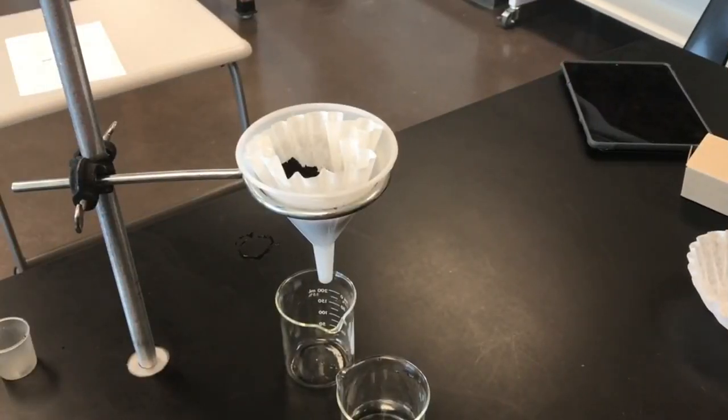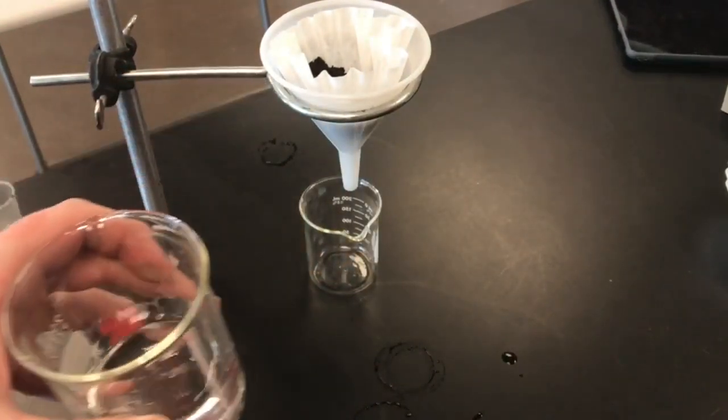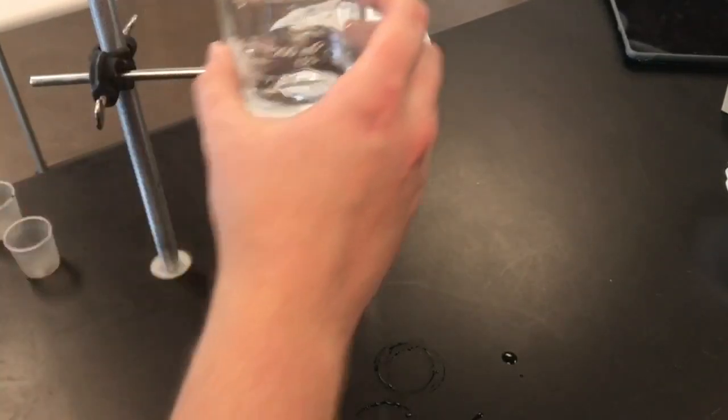All right, so once I've got my initial pH reading, I'm going to take my sulfuric acid solution and I'm going to slowly pour it down through my soil.